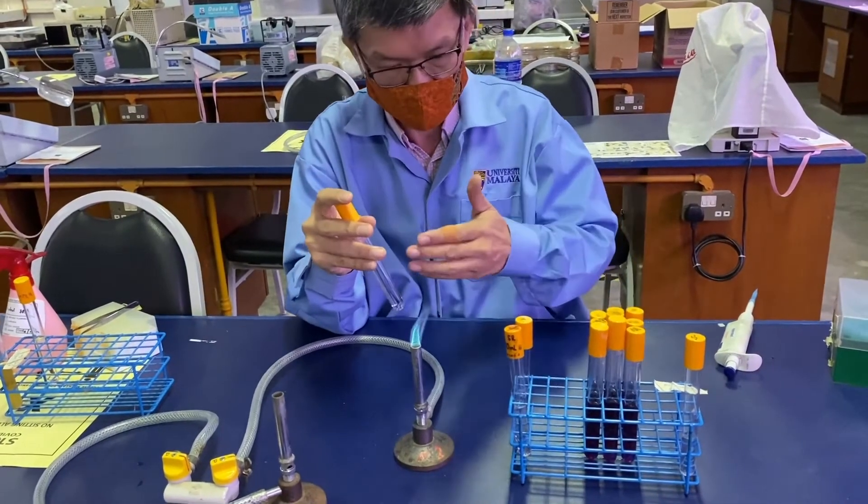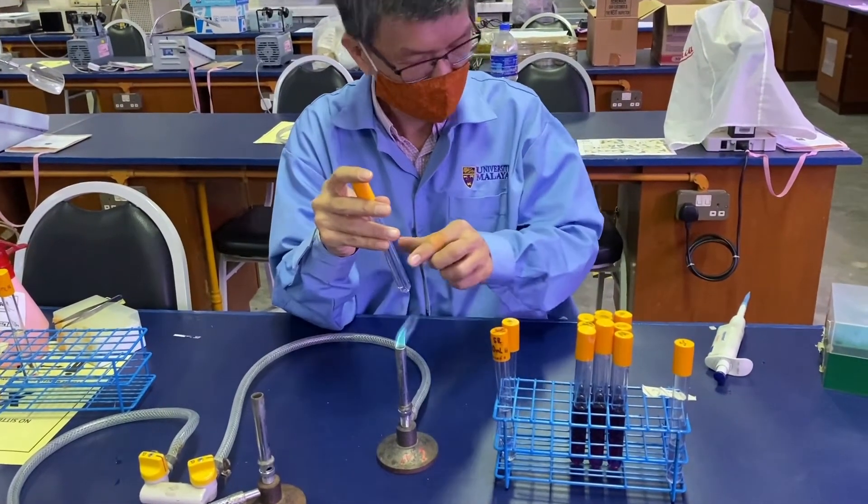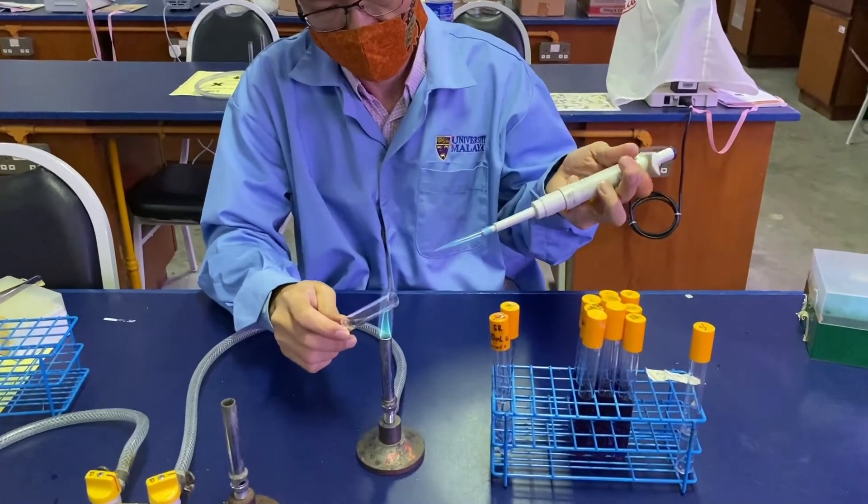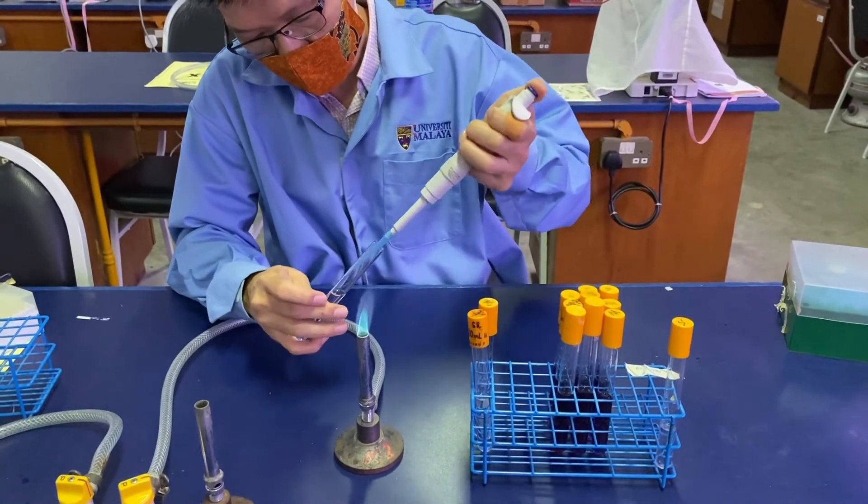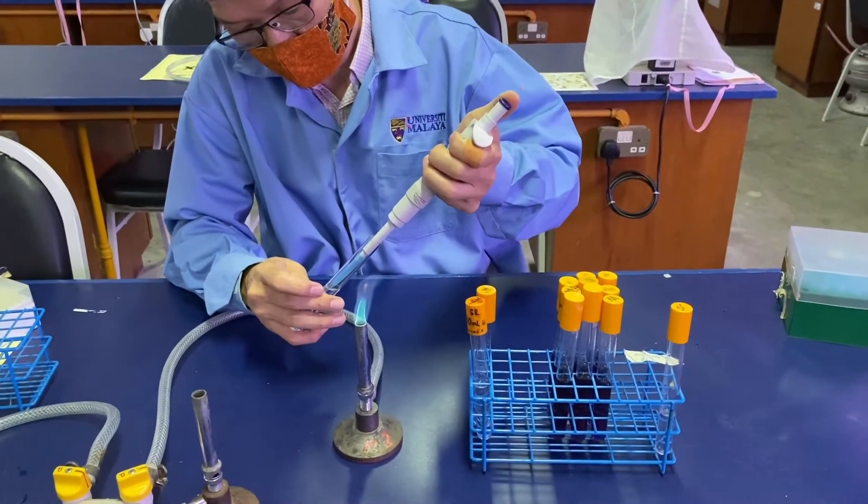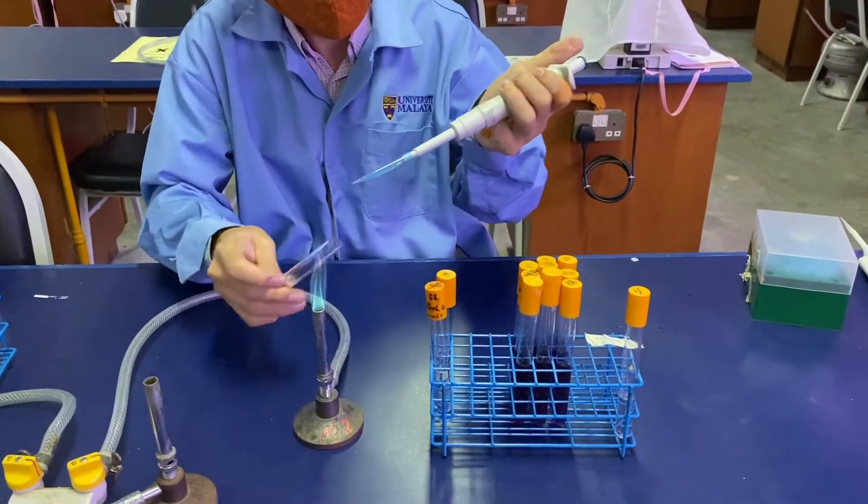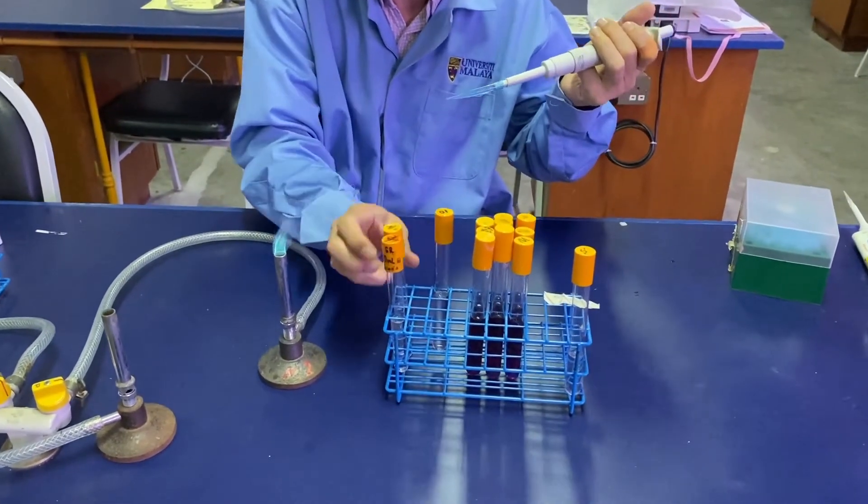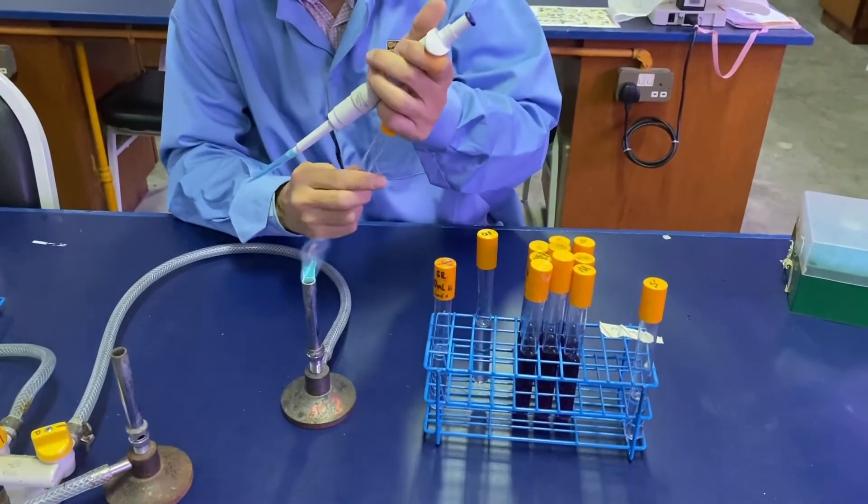Once you have vortexed the test tube, you can continue with the serial dilution. One milliliter from the minus one tube proceeds to the minus two tube.